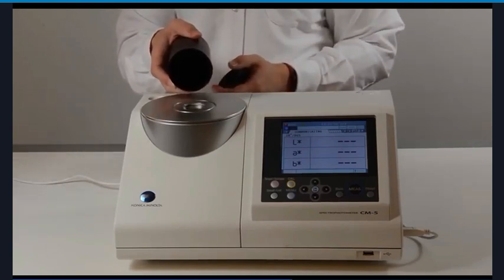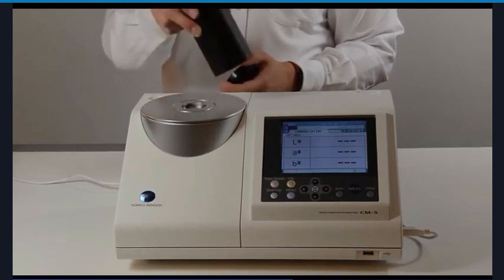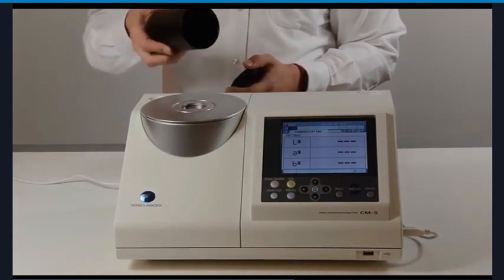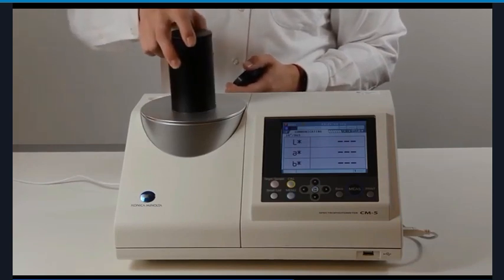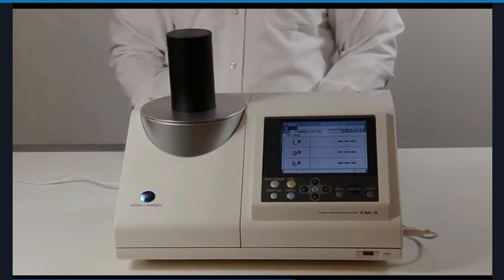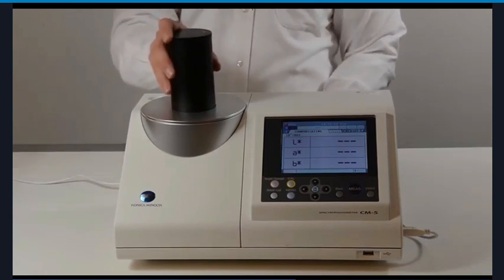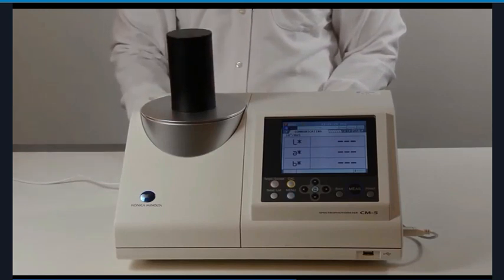This optional accessory is a relatively tall, dark cavity that traps nearly all entering light. The beauty of this particular setup comes from the ability to actuate the white calibration plate from the software. This allows the software to switch between the white and black target backing, so we don't have to physically change out the backing material for every haze measurement. Because we calibrated for larger samples, we will keep our measurements consistent by keeping the transmission chamber open.